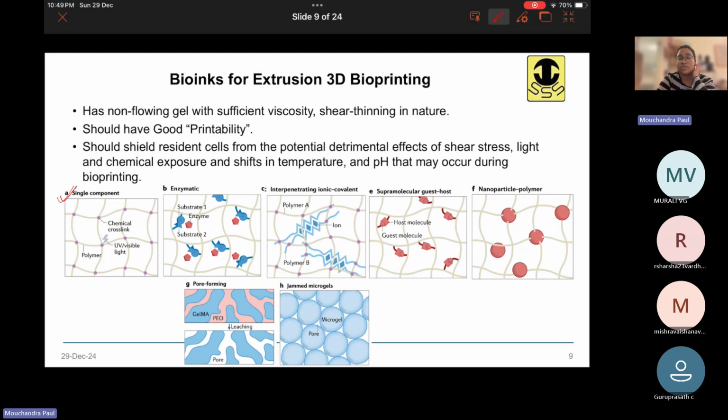But alginate is not very shear thinning, so you have to make the composition a bit shear thinning. So that's a bit more tricky, but you can do that by partially cross-linking it. And then complete cross-linking can happen after the printing is done by exposing it to a bath of calcium chloride solution and all. Okay.